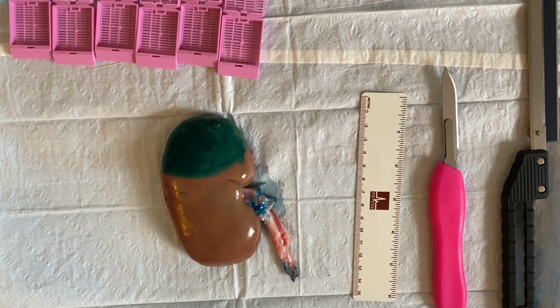When receiving a kidney specimen, make sure that you weigh the specimen in grams, measure the kidney overall in 3 dimensions, and measure the hilar structures in length and diameter. In order to orient a kidney, you utilize the hilar structures.